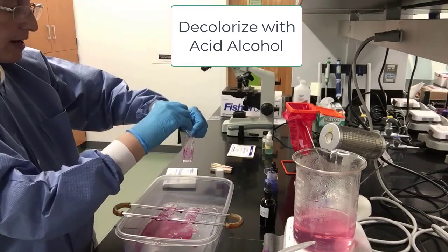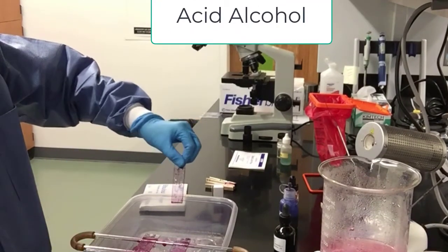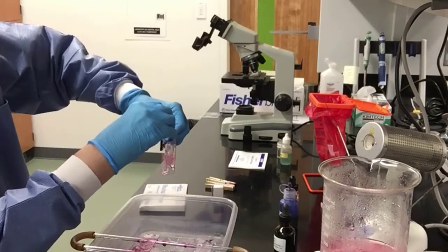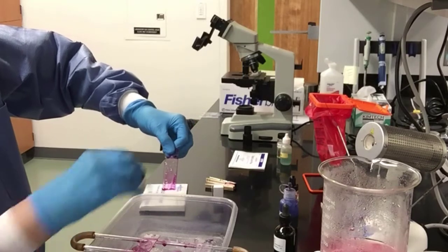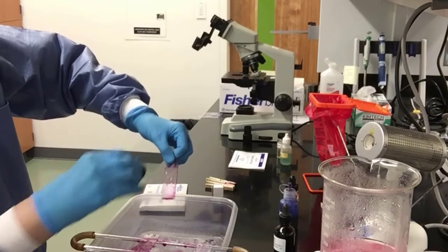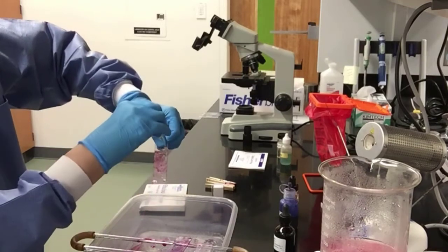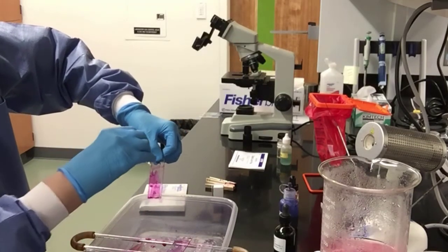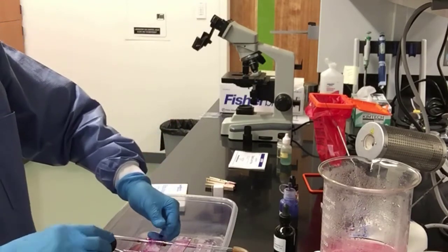We let it drip down quickly, few seconds, until we see some of the red come off. And that was enough for that one. You can see here the stain really comes off of that one. So that's the one that's losing the carbolfuchsin. And here's the third one. Some of those cells are losing the carbolfuchsin with the decolorization step.